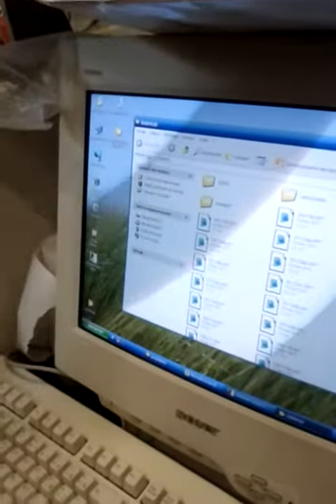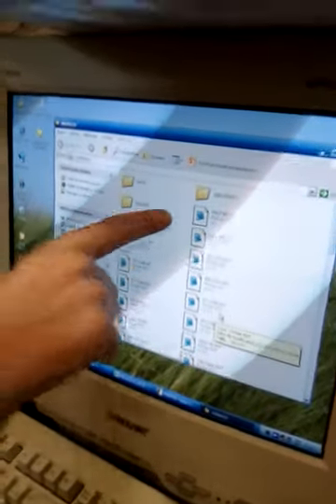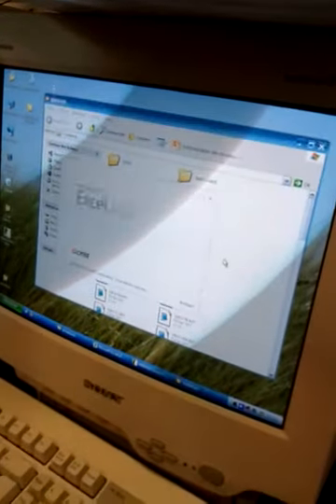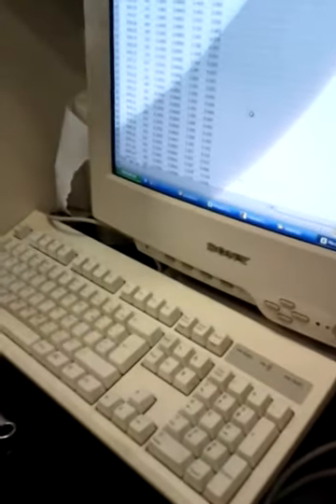We are going to look for 5G, this one and this one, that are the report, and we can open them directly with Excel. And here we get all the results. It's all a little bit strange. It's not well organized. Okay. And in fact, what are these values?